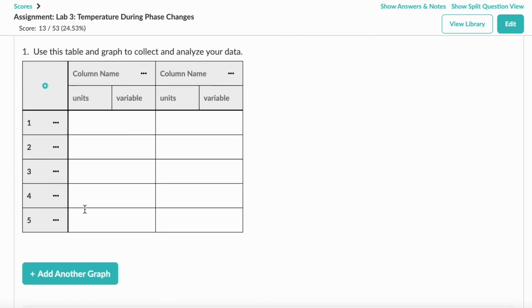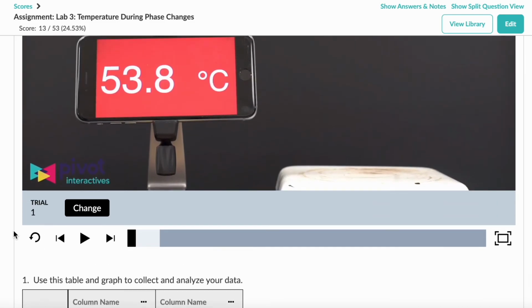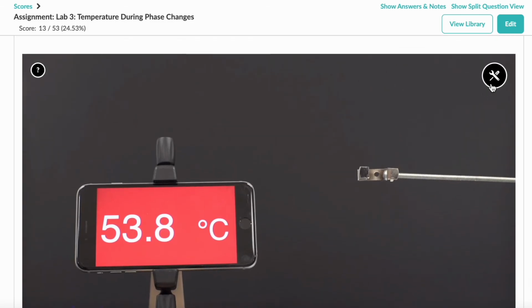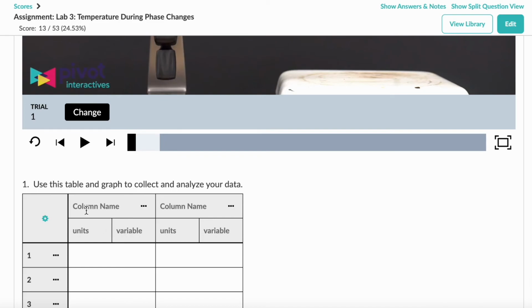So for this one, I would like to see at minimum 35 data points. So you should keep entering until you see 35 right here. So I'm going to let you make the decision on how much the increments will be, like how much you increase each increment by. Remember, you're measuring time and temperature, right? Your time comes first here, and then your temperature is over here.